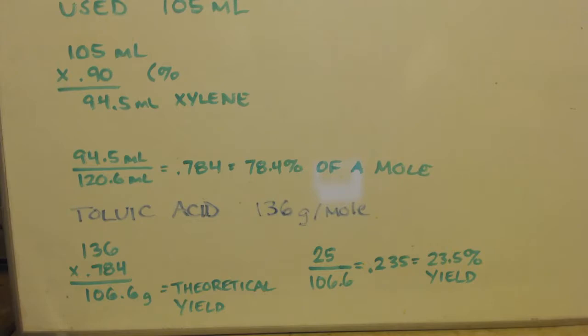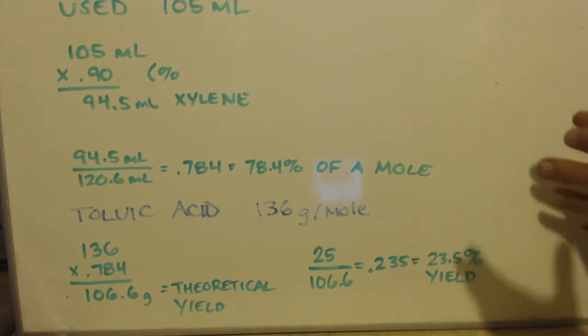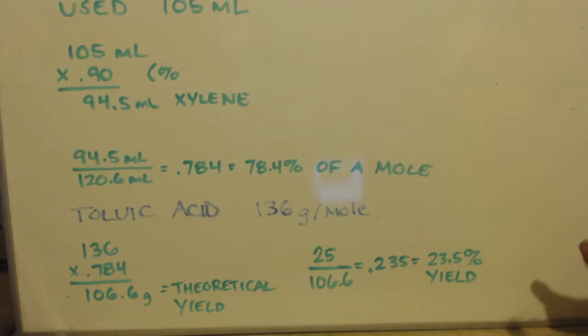Okay, so I have the toluic acid. I refluxed it for an extra 5.5 hours. Now, I refluxed it the first time for 7.5, and then I filtered it. The next 5.5 hours, I refluxed it and filtered it again. I didn't get barely anything, so that was a waste of time.